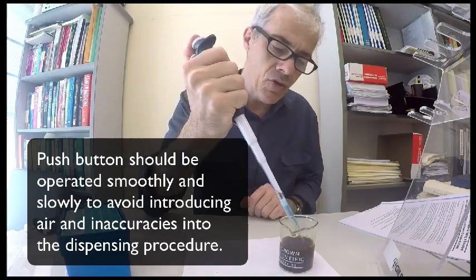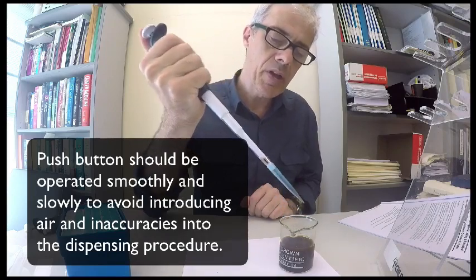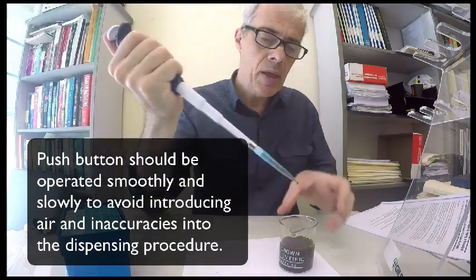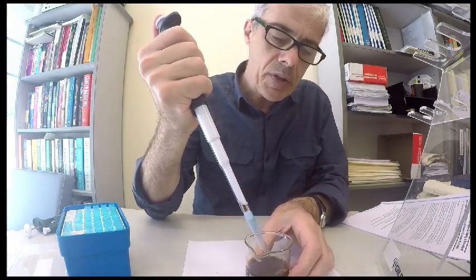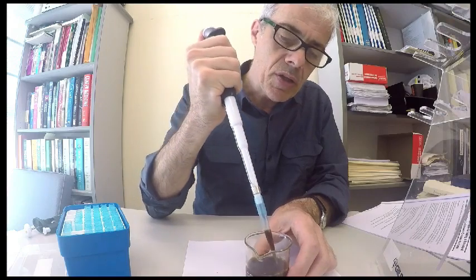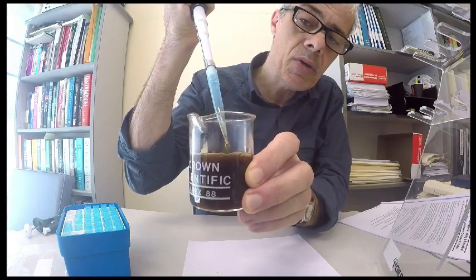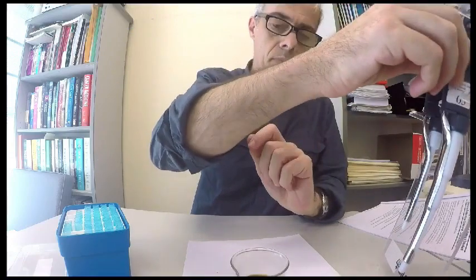And you can draw up slowly, and you can be a little more firm when you're dispensing. Often you'll get bubbles on the end. Depending on what you're dispensing, I often dispense onto the side of the container, and that way you tend not to get residue left in the tip. Okay, so as a brief introduction to using micropipettes, hopefully that will suffice.